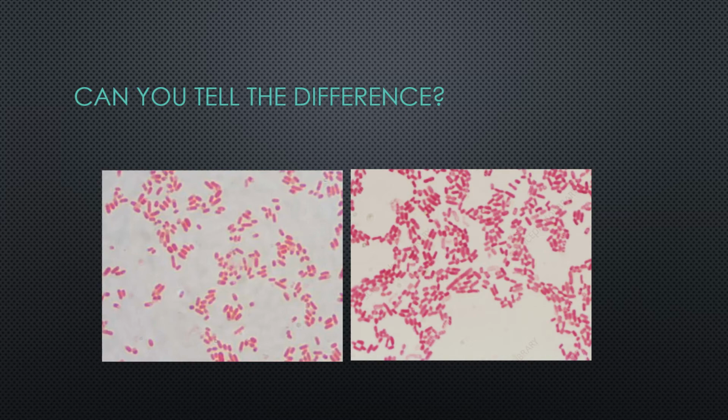In a microbiology lab, scientists rely on whole batteries of tests to look at how bacteria process nutrients and then use that information to identify them. Another common technique is to use the DNA genes inside of a bacterium to help identify them. We will look at both over the next few labs to help you identify an unknown bacterium that I will provide to you.